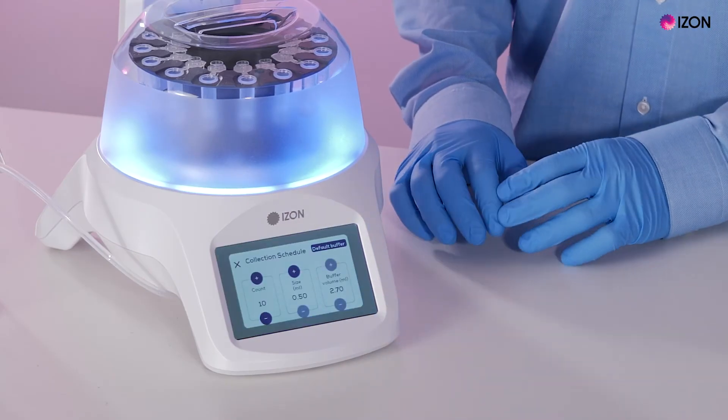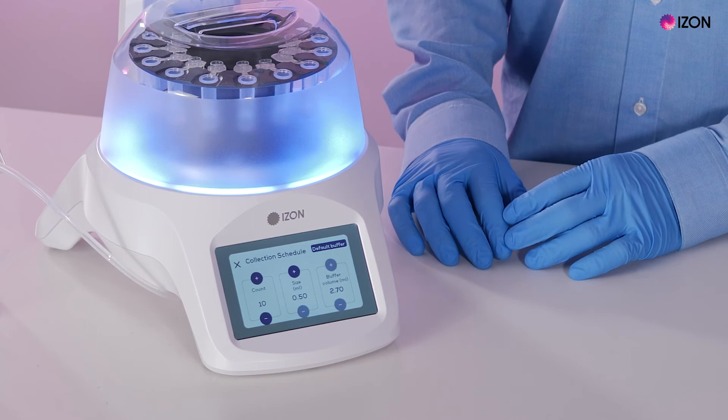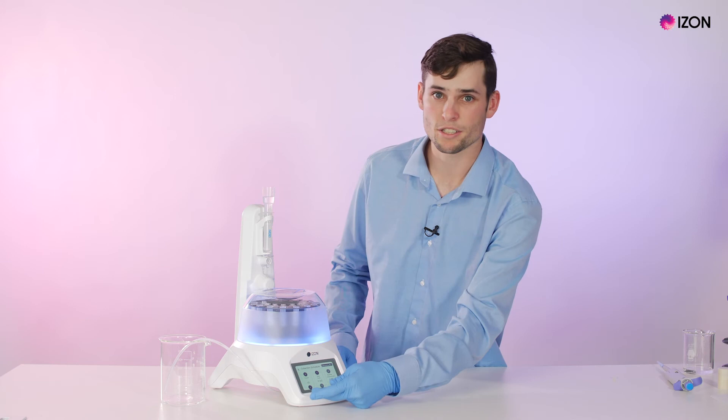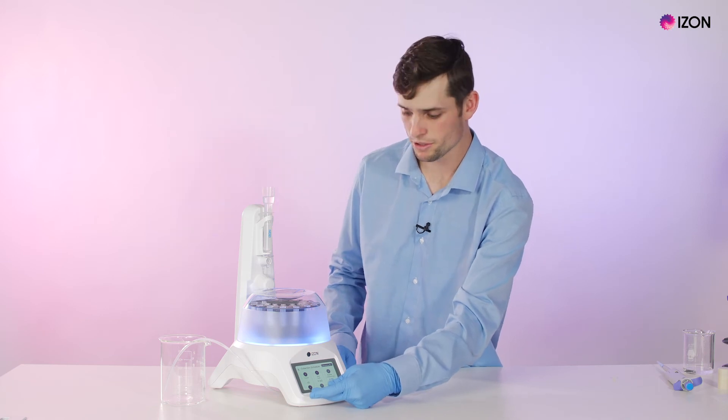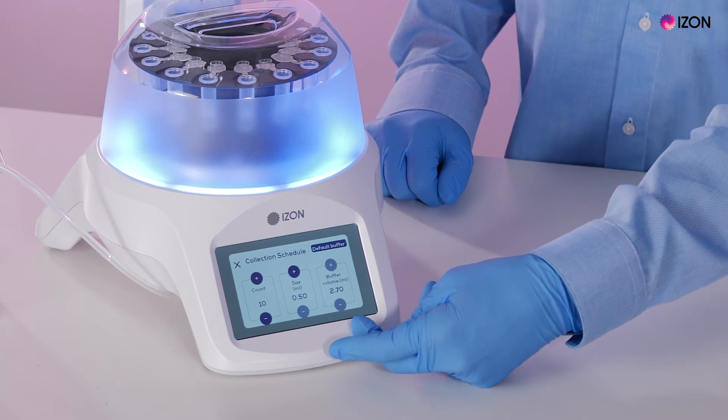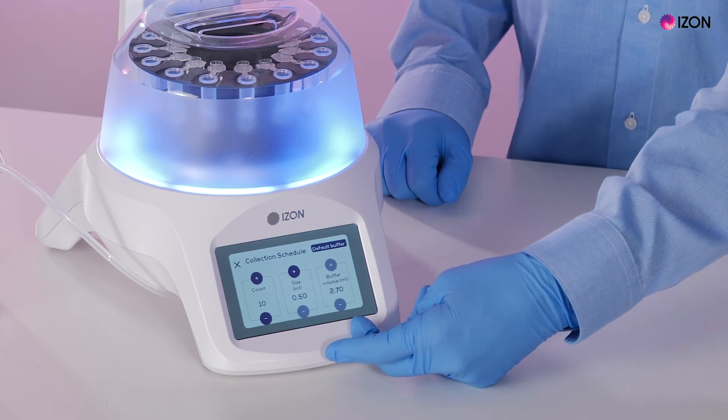By pressing on the collection schedule it allows us to customize what volumes we want to put through our AFC. There are three categories you can modify: the count of centrifuge tubes that we want to use, the volume going to each tube, and the buffer volume that will be dispensed into the middle before the collection of the samples.